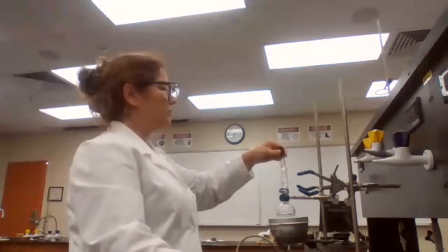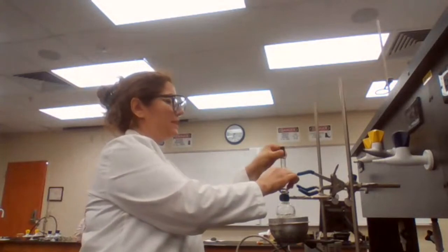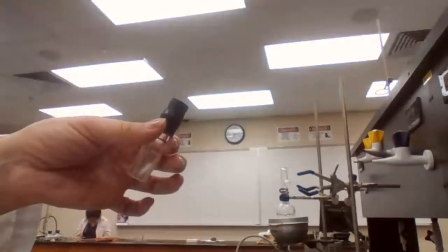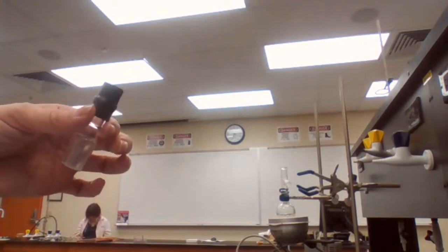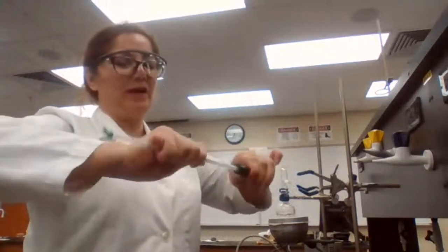You have a thermometer adapter, with a glass joint again. We are going to attach the thermometer adapter to the distillation head, and the thermometer is going to be inserted into this rubber piece. To insert the thermometer, you would hold the thermometer and twist and push, not force it.